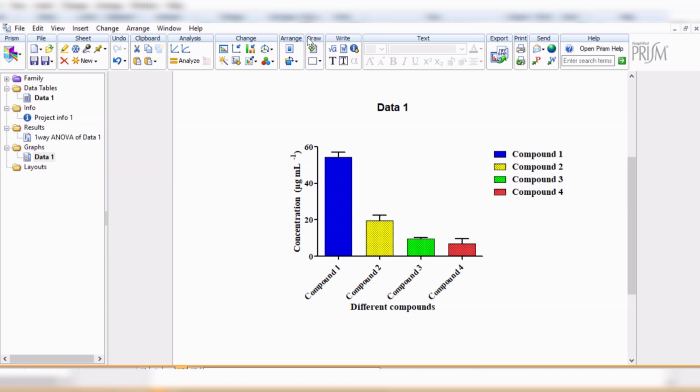We need to draw. From this section you can draw. Here you can see there is a draw written. From the draw you go to this menu and select a drawing tool. I will select this one. You can select any line. I will draw the line to the midpoint of the error bar. So this is the significant line that you have drawn.